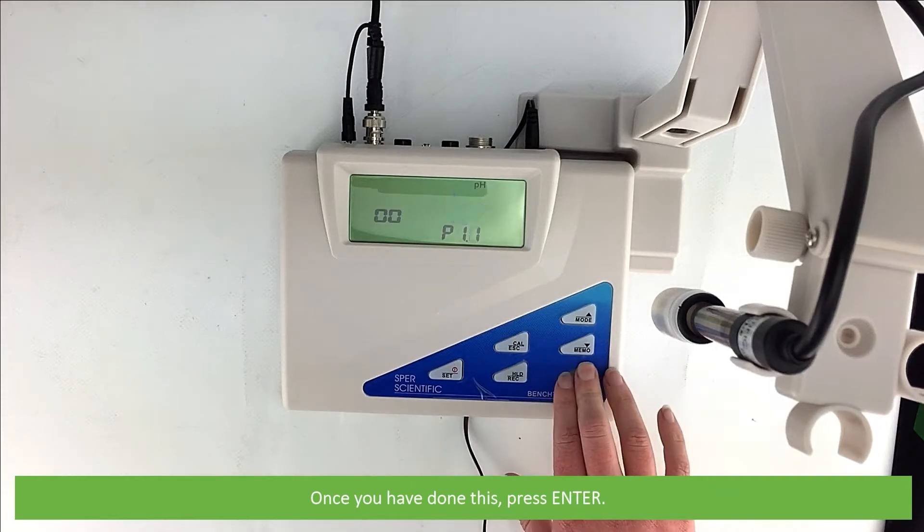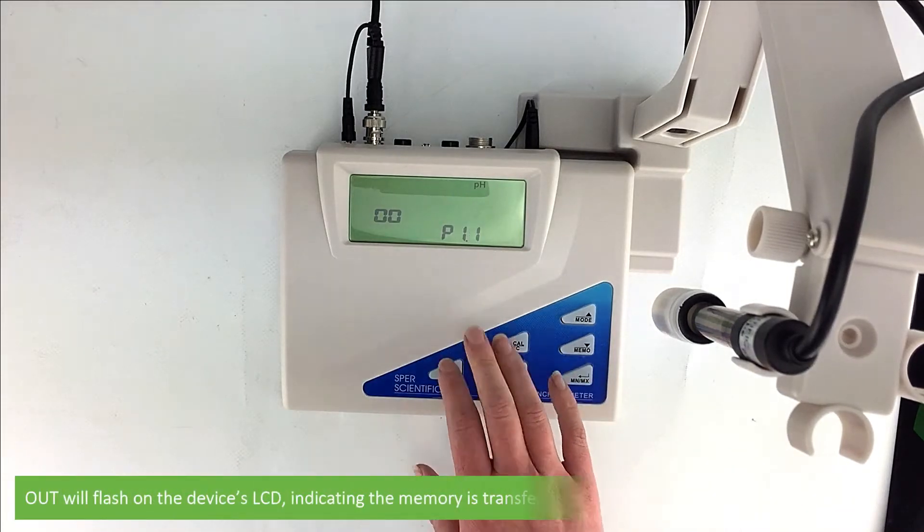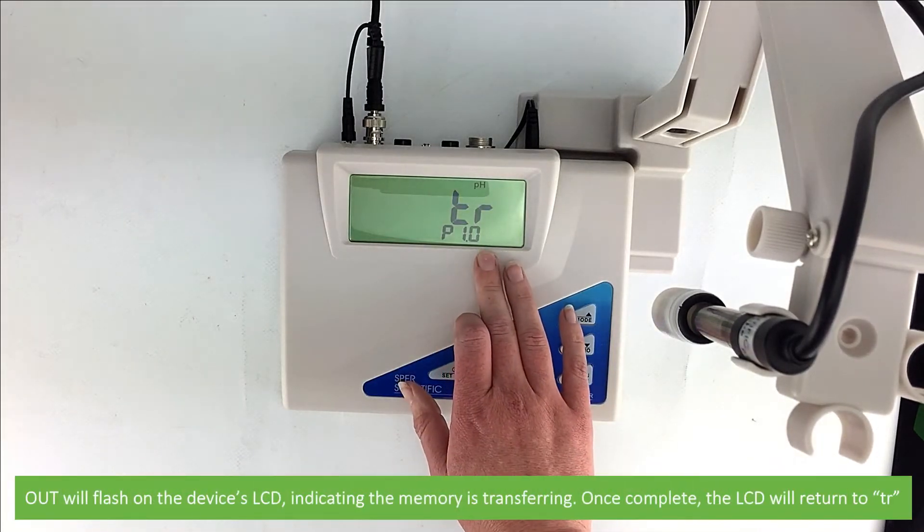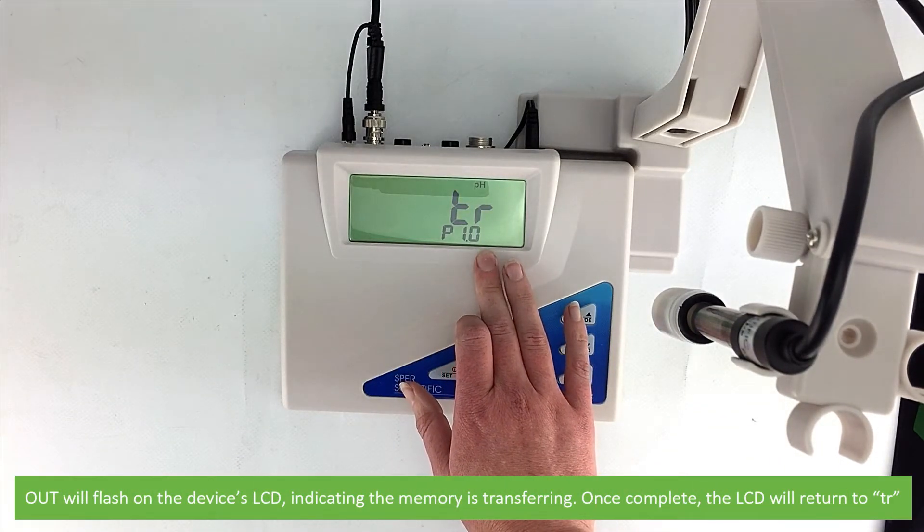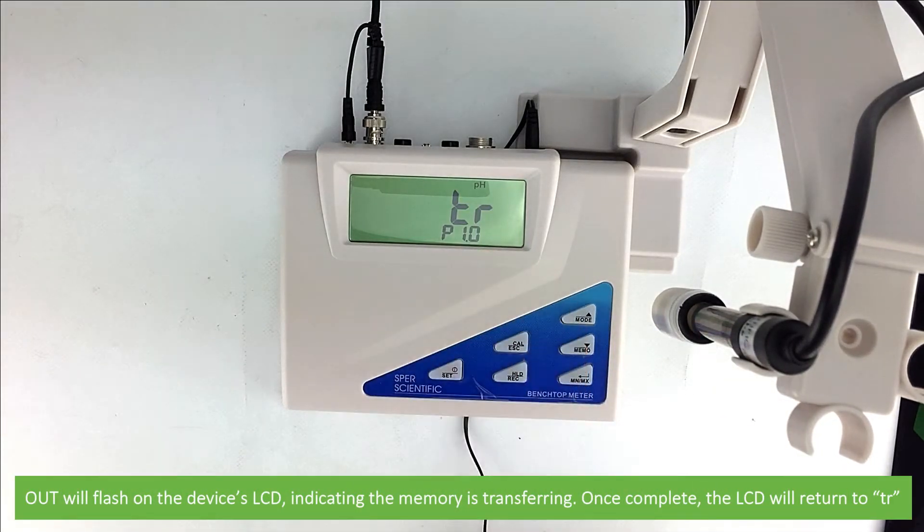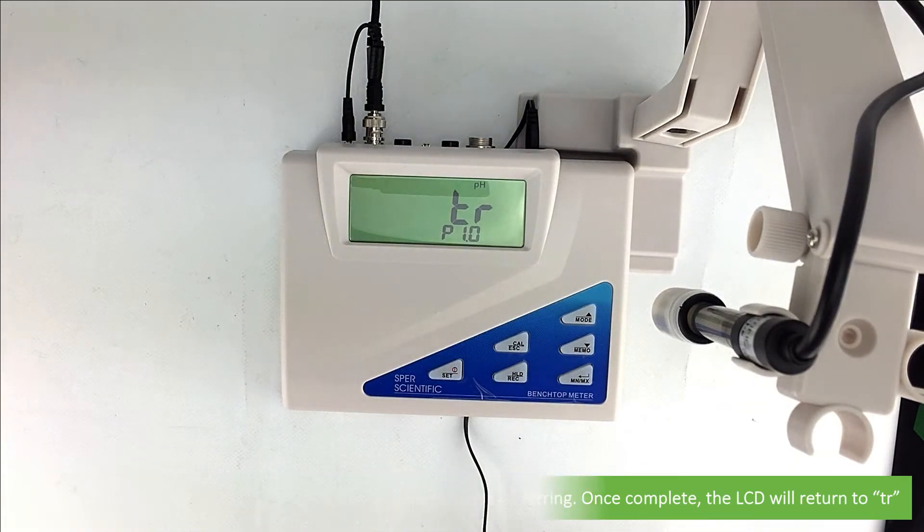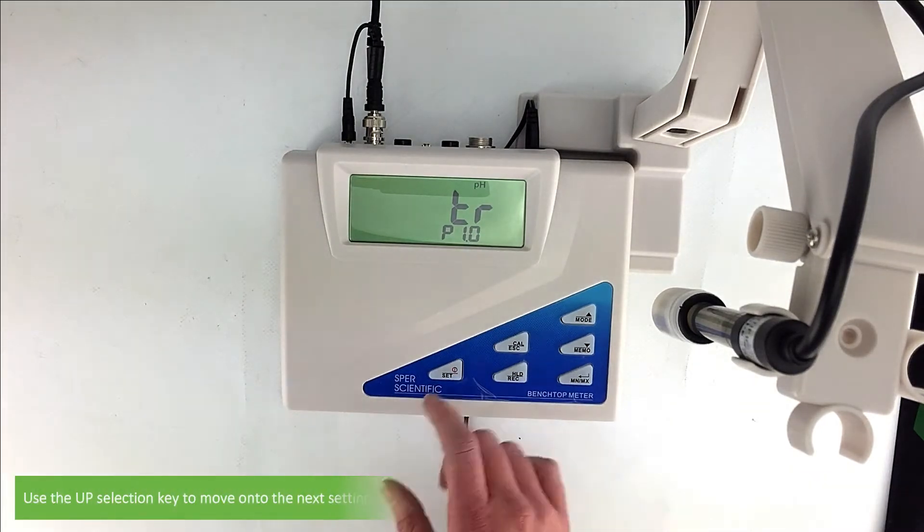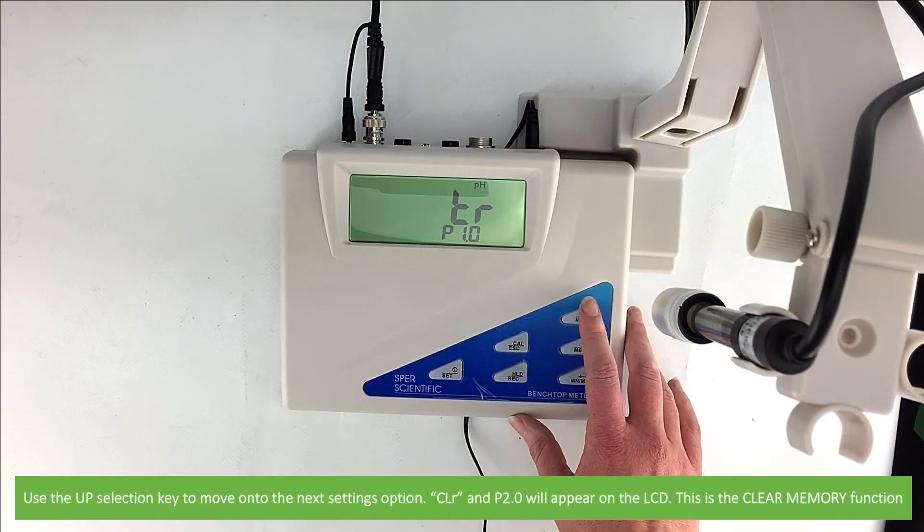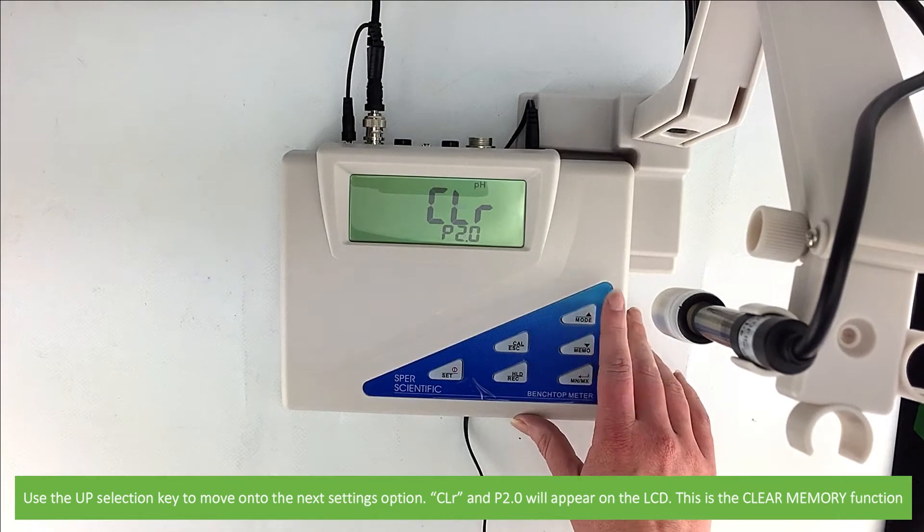Once you have done all this press enter and out will flash on the device's LCD indicating that the memory is transferring. Once complete the LCD will return to TR. Then use the up selection key to move on to the next settings option.